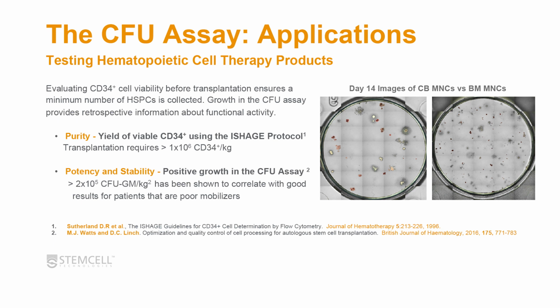Not everybody can measure the CD34 cells the same way. Flow can be a little bit unstandardized, and different people can look at it differently based on gating strategies. So there was a protocol published in 1996 to try and standardize this. Unfortunately, surveys have shown that not everybody uses that protocol. But nonetheless, when you look at a lot of the clinical trials and successful transplants, it usually recognizes that if you inject 10 to the 6 CD34 cells, that should be a good dose for the transplant. But injecting it is one thing.